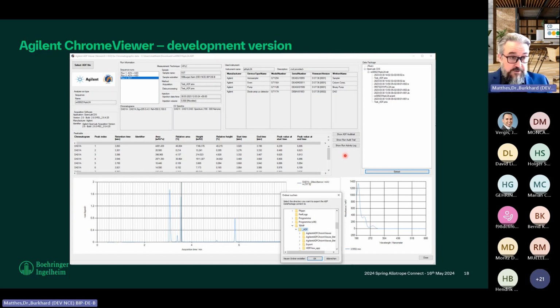When we have auditors in our facility that want to see electronic raw data, usually the first question is, show me the audit trail. And this greatly simplifies the process. So we don't need to go into the original file format. If the auditor wants to go into the original file format, we have this extract button over here. This extracts the contents of the vendor-specific binary files to our file system, and this can be reopened with the vendor-specific application, that's ChemStation and OpenLab in our case.